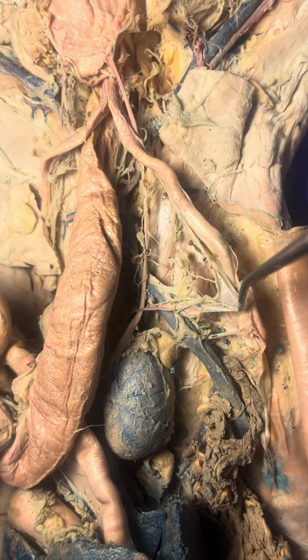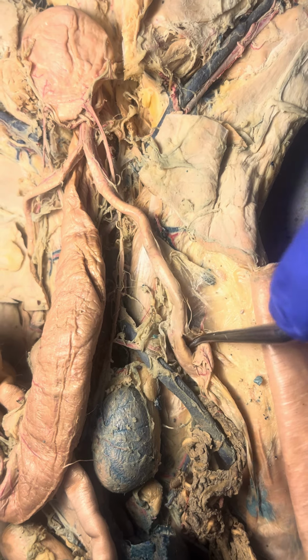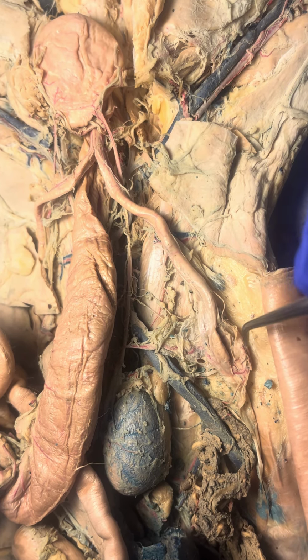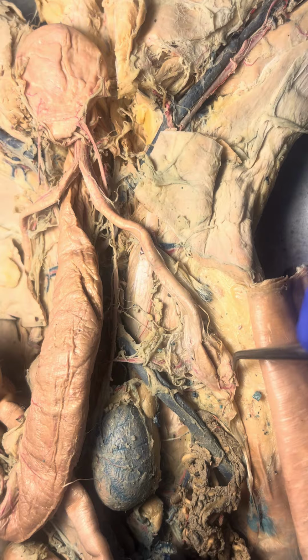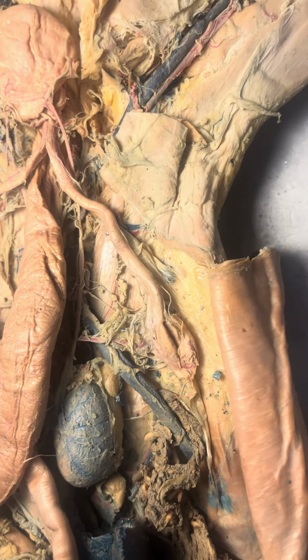And where the uterine horn ends, I have a very small fallopian tube and a very small ovary. And that's right here. Right here, this little circle is the fallopian tube and the ovary. Let's see if I can see it better.